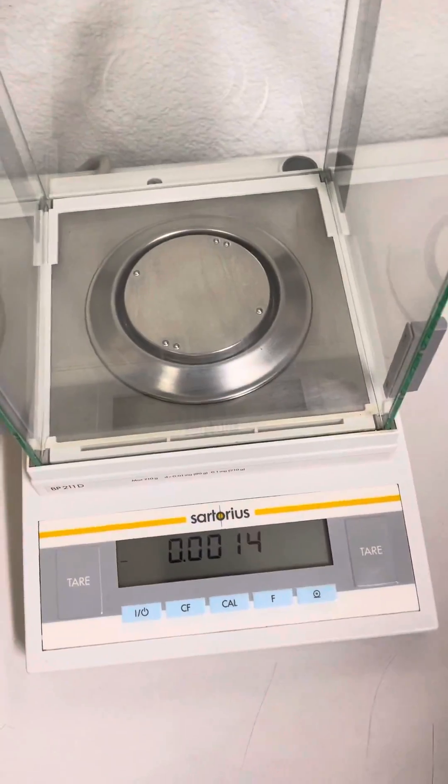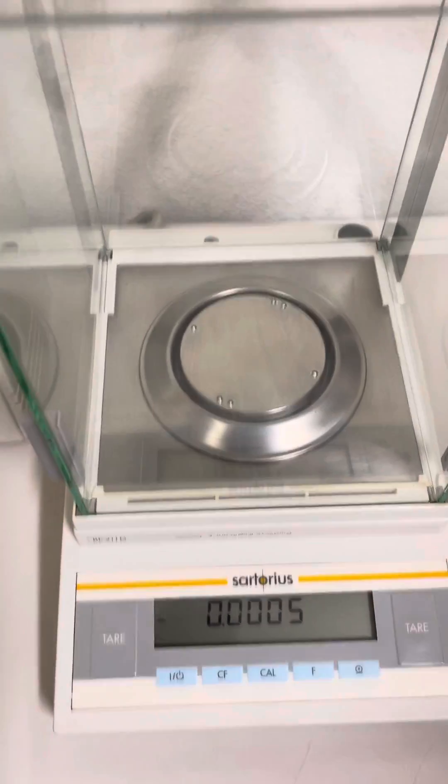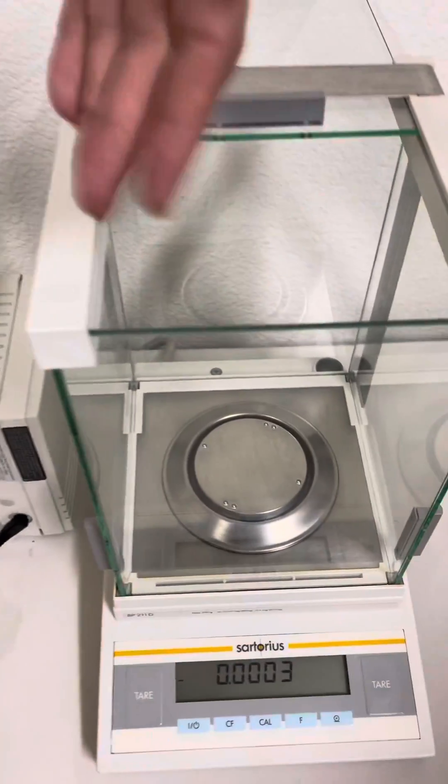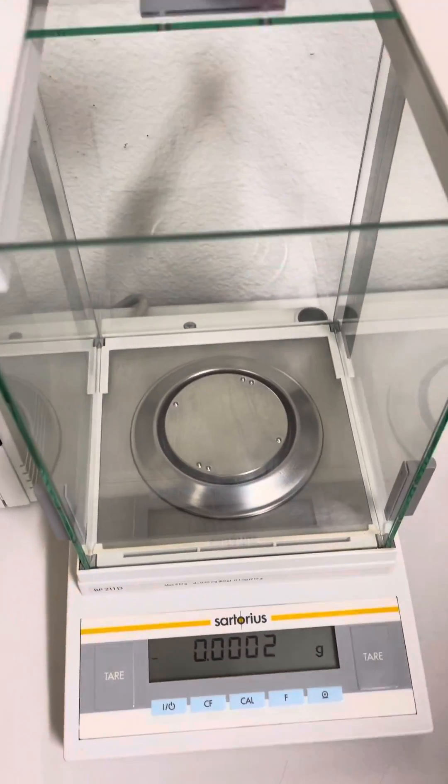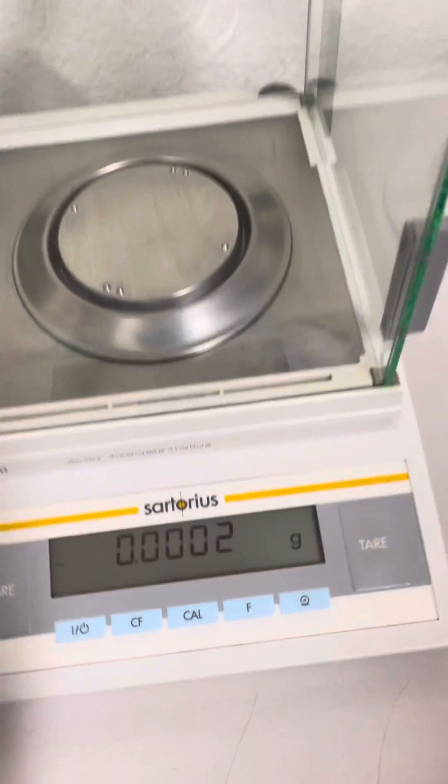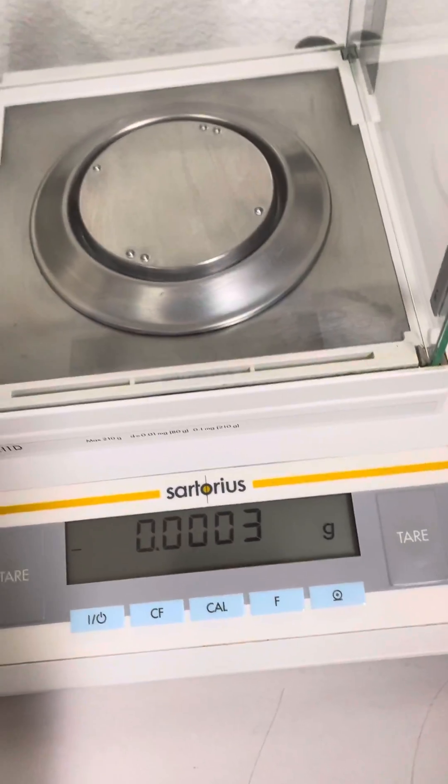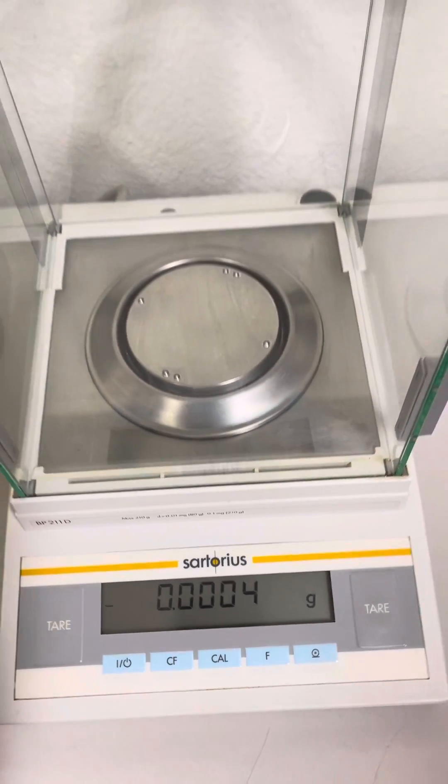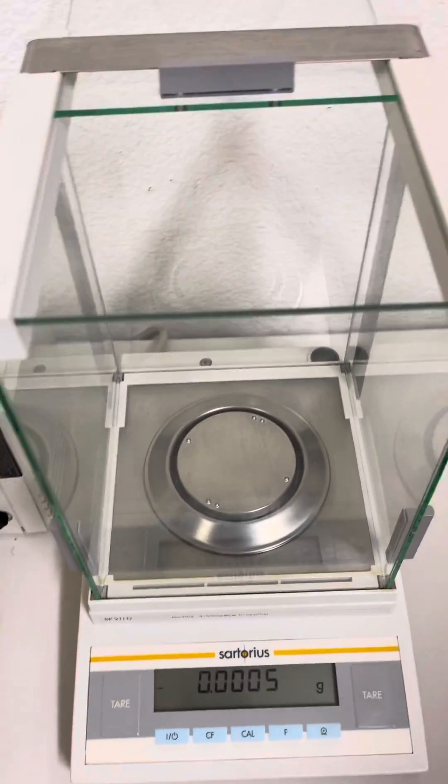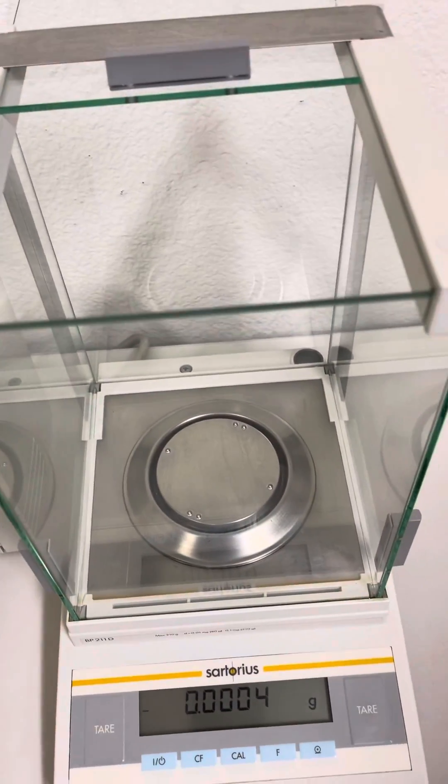I'm waving my hand to show the accuracy. If I blow in it, you can see the reading change.